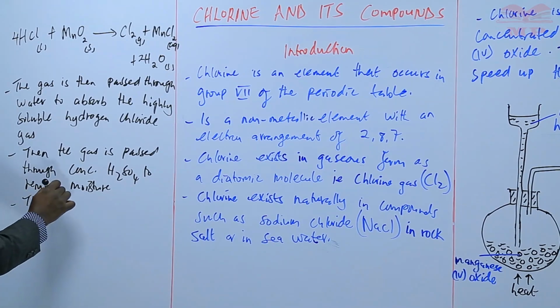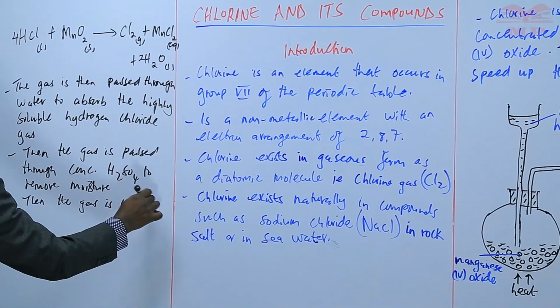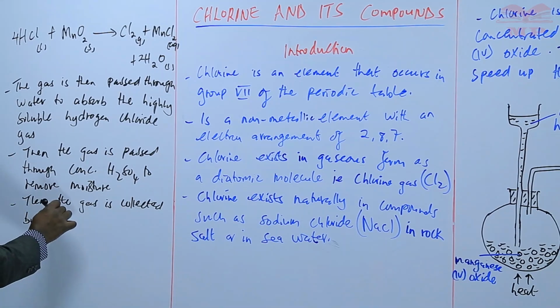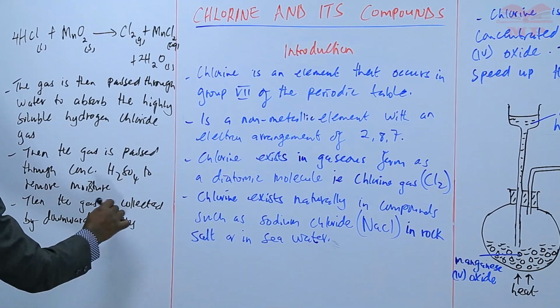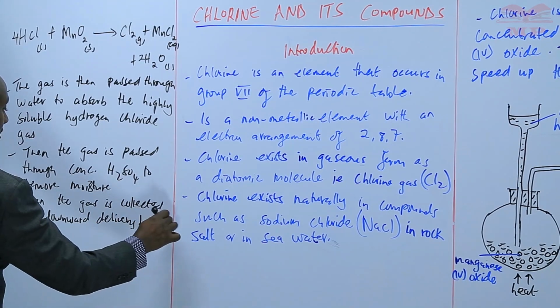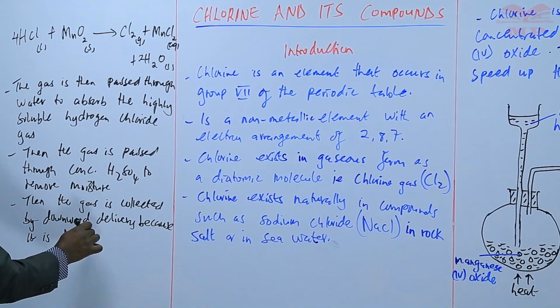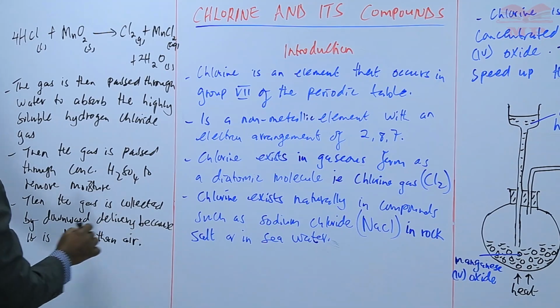Then the gas is collected by downward delivery because it is denser than air.